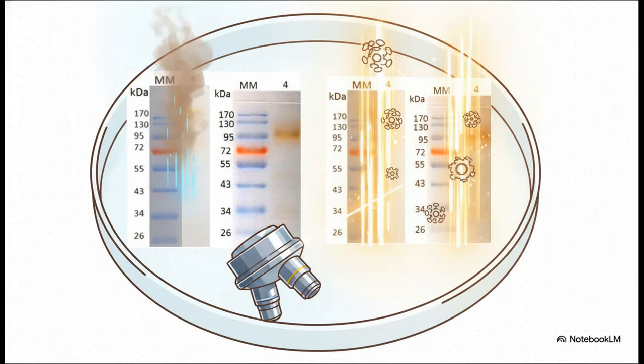Now, we can also track these enzymes on polyacrylamide gels using a process called zymography. These side-by-side results are pretty wild. On the left, researchers used a standard phosphate buffer, and you can see the brownish protein bands are really faint. It definitely limits what we can detect.